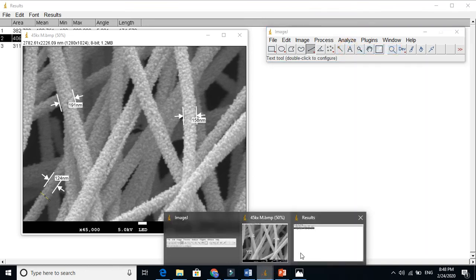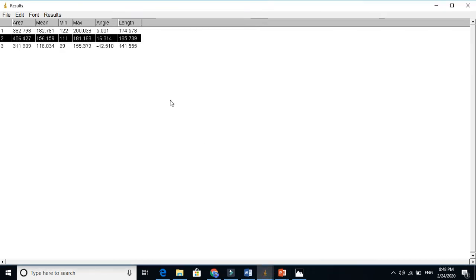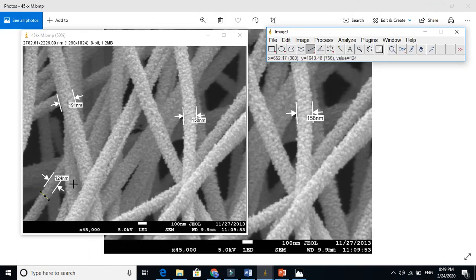This window is already open — 141. How much was that? 144. It is almost close.